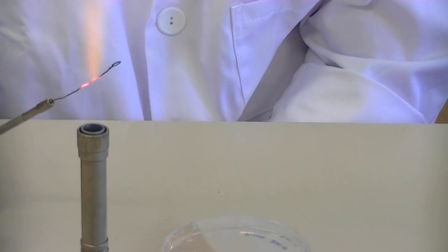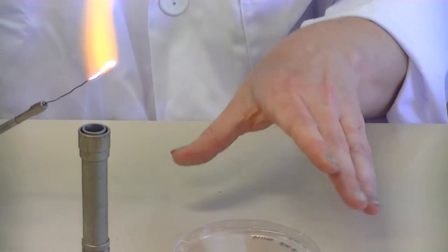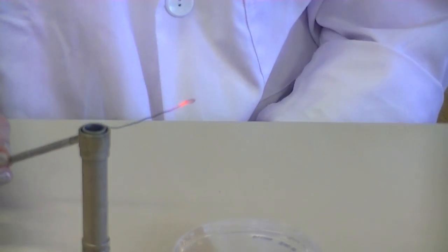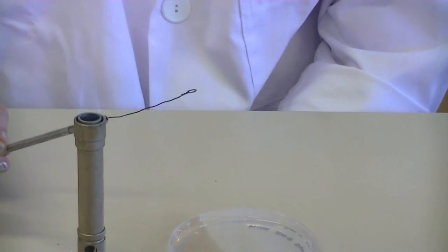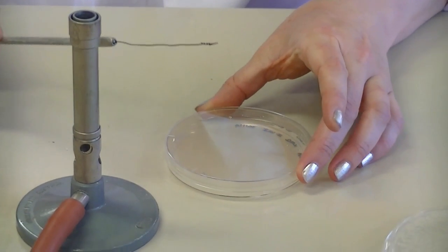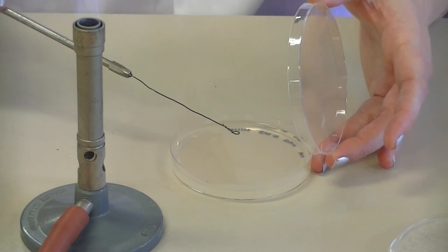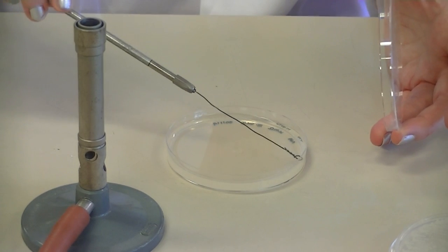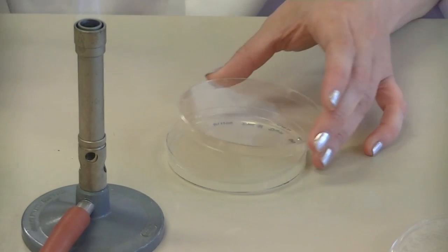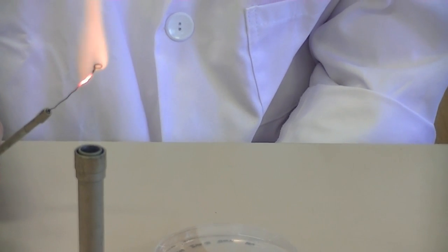Flame your loop again. It's really important when you're streaking that you make sure your plate isn't exposed to the air for very long — after each set of streaks, you should replace your lid very quickly. Once your loop has cooled, touch it to the surface to make sure it's cool enough, and then turn the plate and intersect your secondary streak lines to create your tertiary streak lines. Replace the lid and then flame the loop for the final set of streak lines.